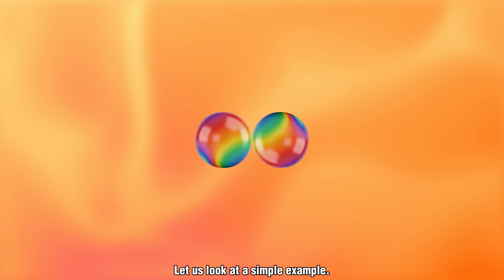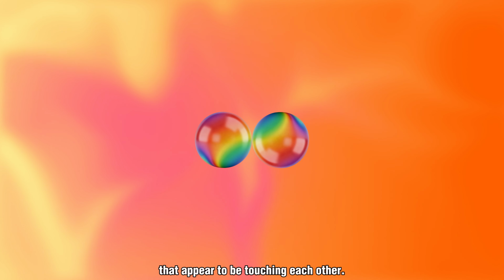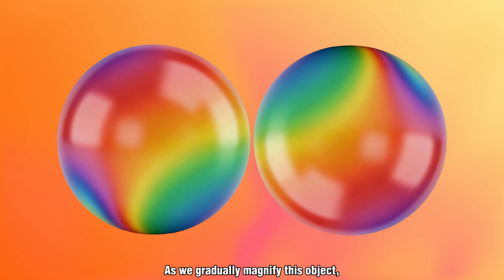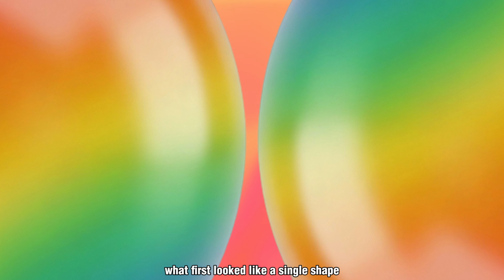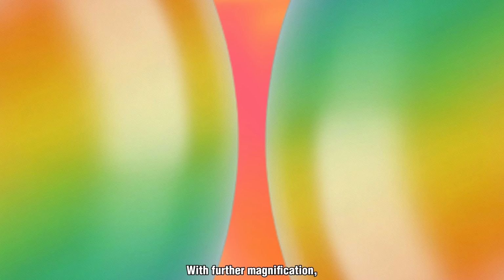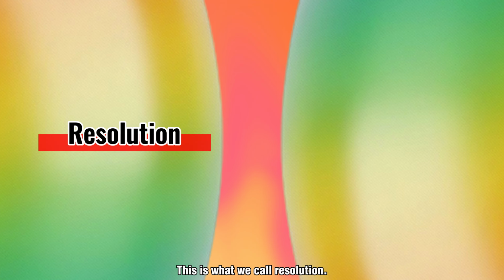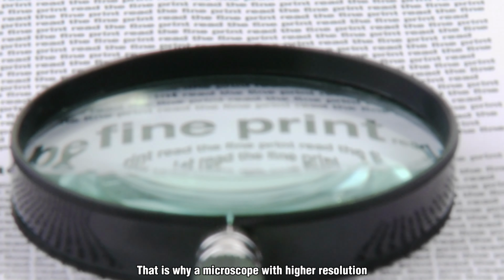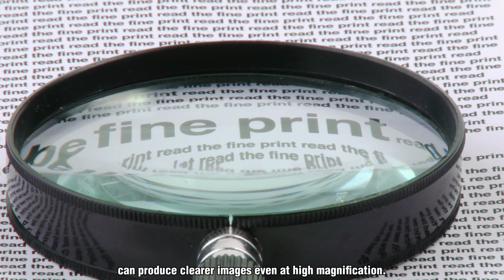Now let's look at a simple example. Imagine two very small circles that appear to be touching each other. As we gradually magnify this object, we begin to see that what first looked like a single shape is actually made of two separate circles. With further magnification, the distance between the two becomes clearer and easier to distinguish. This is what we call resolution. That is why a microscope with higher resolution can produce clearer images even at high magnification.